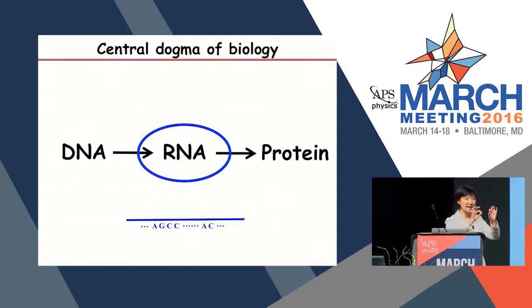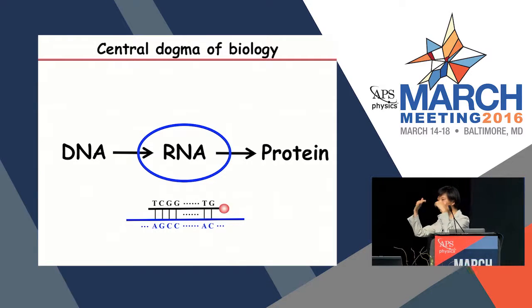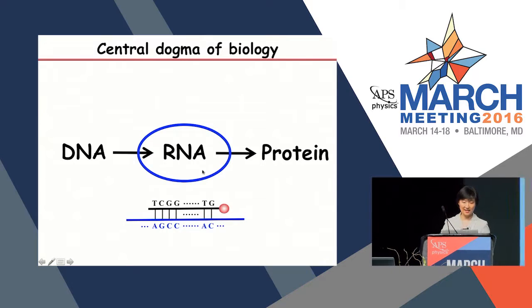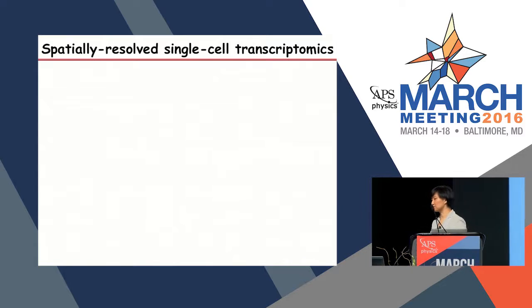That's because it has these nucleotide sequences, and then you can come up with orthogonal or complementary sequences that bind to them very specifically, and then at the end of this little oligo, you can attach a fluorescent dye, and this way you can very systematically label all RNA molecules easily. That's called fluorescence in situ hybridization, FISH. That's easy to remember.